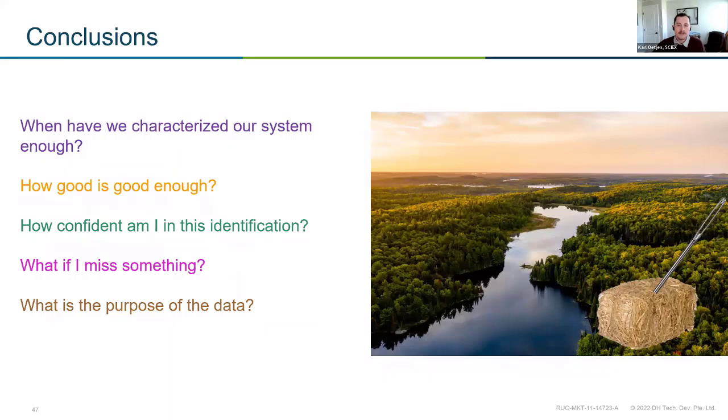But regardless of what approach you take or how you go about screening your data, prioritizing your data, it all comes back to those questions of what is the goal of this data set? How am I going to search through it? So if my goal is to only look at fluorinated compounds, maybe doing something like a suspect screening approach might work really well, especially if we're looking at, maybe a soil where we're not expecting new fluorinated compounds.